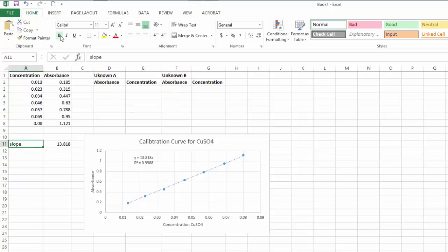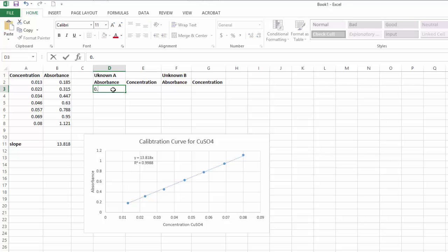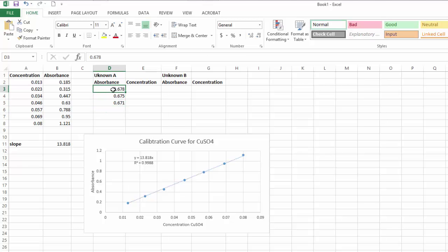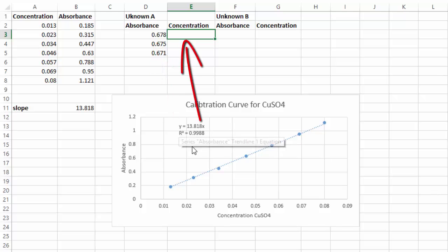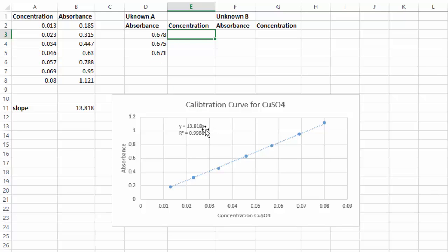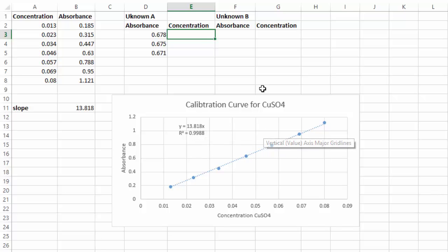Your unknown absorbances and concentrations will be different — this is data I've gathered from different labs. Pay attention to the process. For Unknown A, I'll type in absorbances: 0.678, 0.675, and 0.671. To calculate concentrations, remember y in this equation is absorbance and x is concentration, so if I plug absorbance in for y I can solve for x.